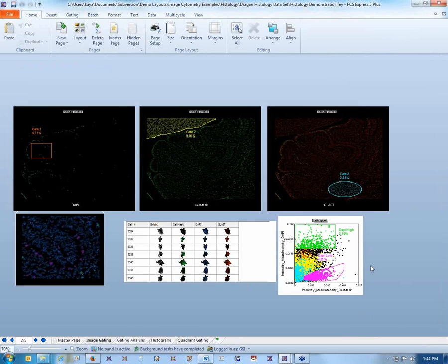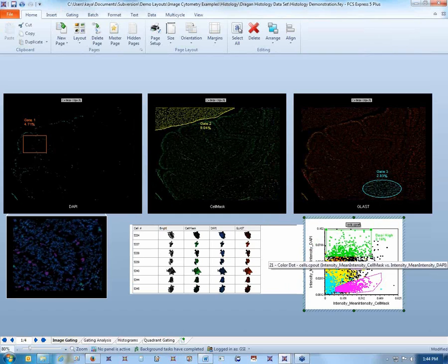There we go. So this is pretty much the same. There are no new principles I want to show you, but it's just kind of cool because it's a very complex image. Maybe if I make this DAPI high gate a little bit larger, you'll be able to see the cells better, because I'm not sure how everybody's monitor is.